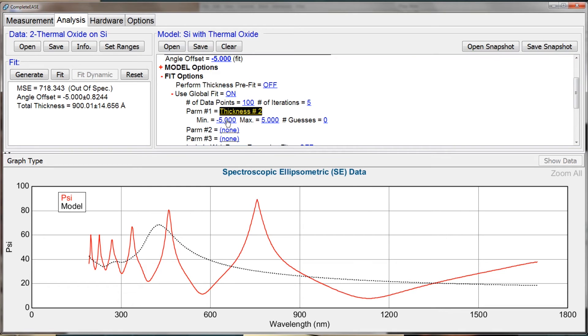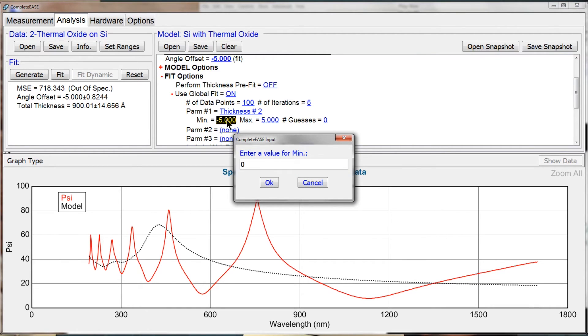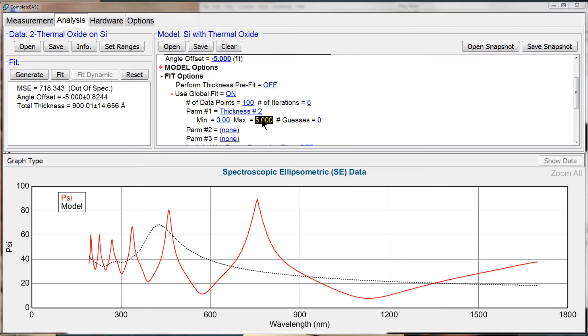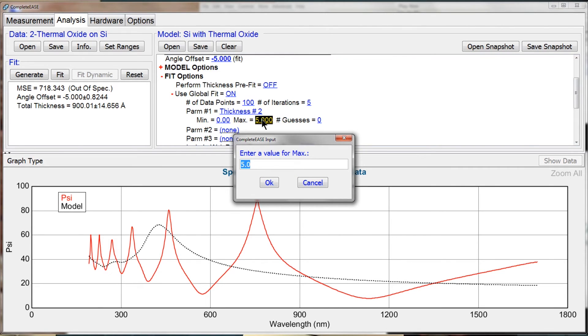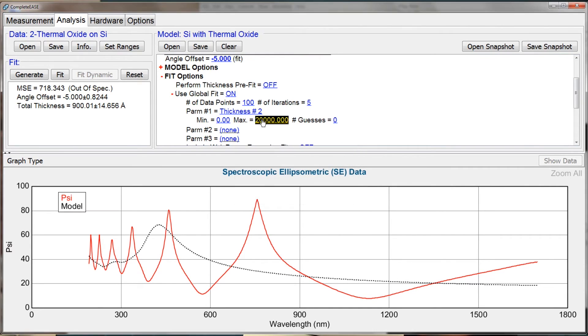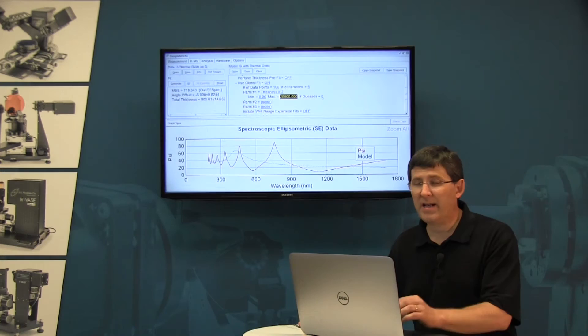Now when I do that, I have to give it a minimum thickness, maybe zero, a maximum thickness, maybe 20,000 angstroms, and a number of guesses.